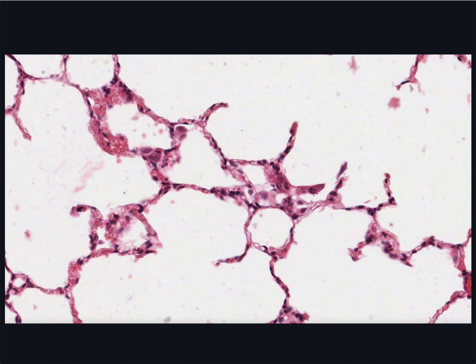Alveolar macrophages can be found anywhere. Once laden with dust particles, they then retire to a comfortable patch of connective tissue. Remember, you saw macrophages in sections of intrapulmonary bronchi I showed you earlier. This may be one here, as the little black dots indicate to me that they just may be dust particles that had been ingested by the macrophage.